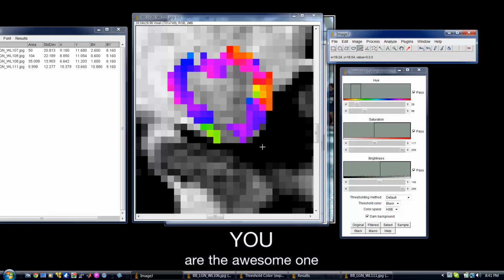I'll have to tweak the calibrations just a little bit. You have to work a little bit on the area that it's picking up because you're only picking up colors. I believe there is a plugin for ImageJ that just picks up certain colors, and I'm still working on trying to tweak that, but this is a quicker way than having to count them individually and having to pick out which colors are which, by adjusting the hues and saturation for this. But that's it for ImageJ.